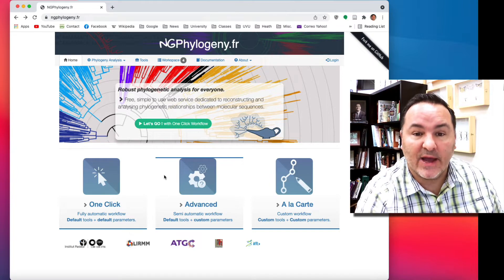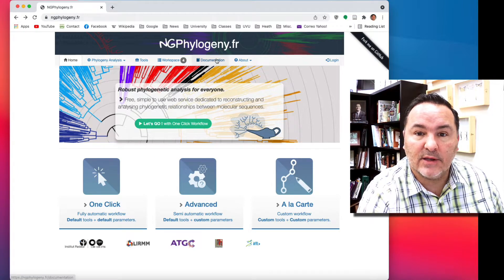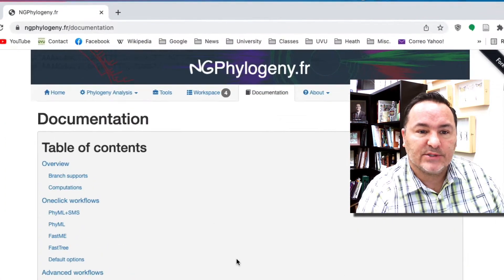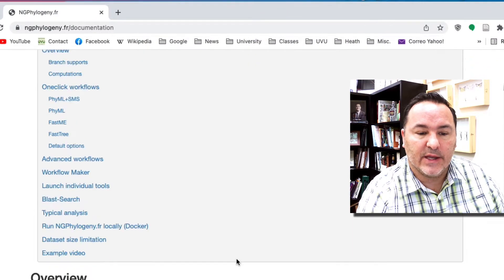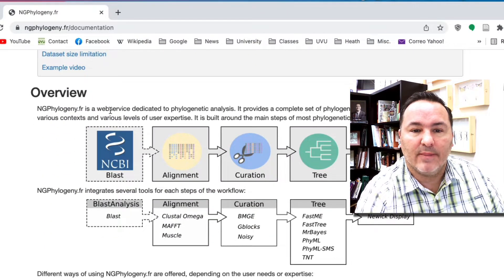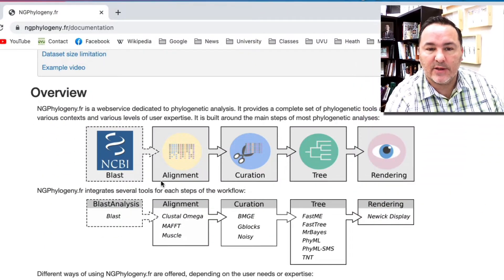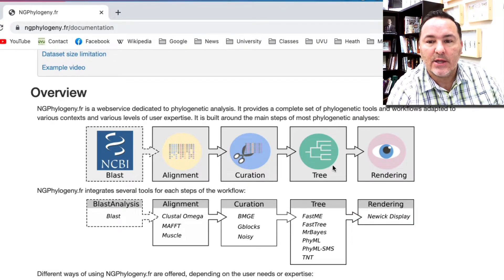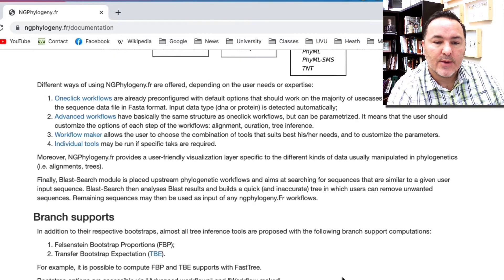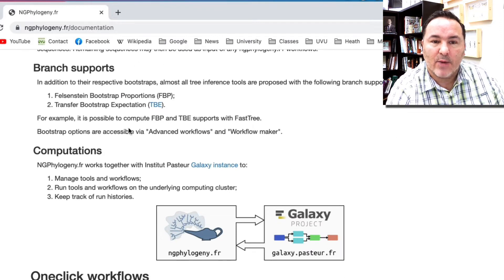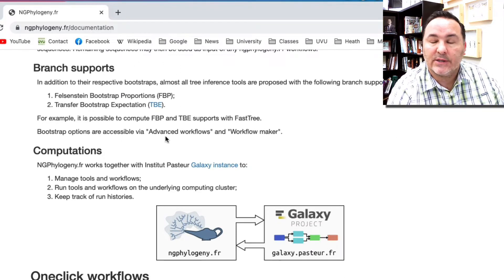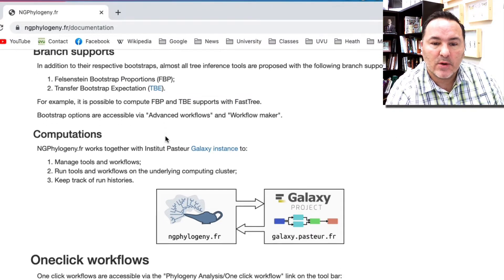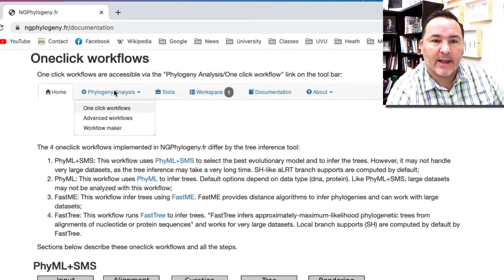I would invite you to spend some time looking at the documentation page, which gives an overview of what kinds of things they could do. They can do anything from blasting, alignment, curation, tree reconstruction, and rendering. This website can also do different kinds of branch supports.